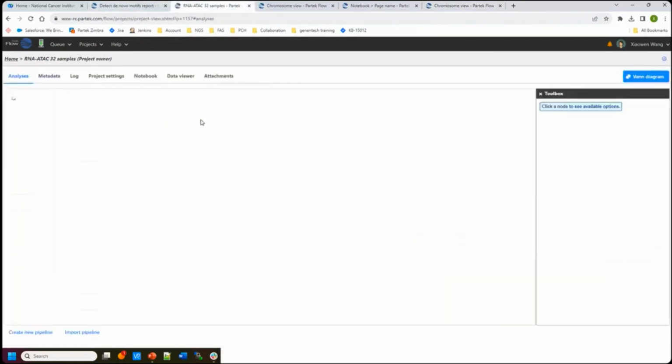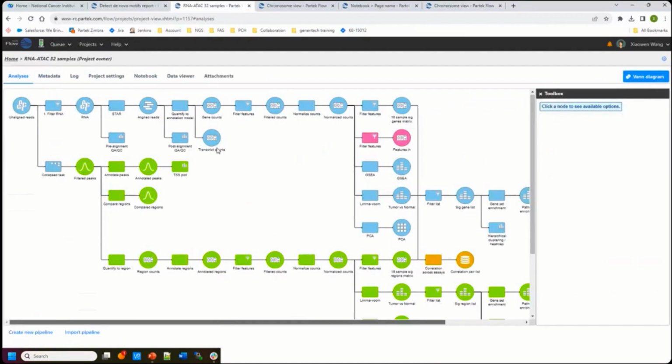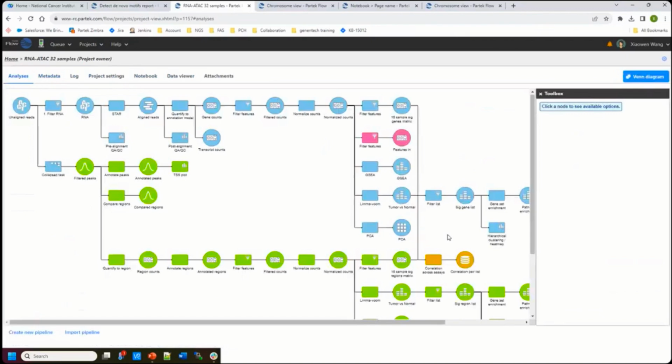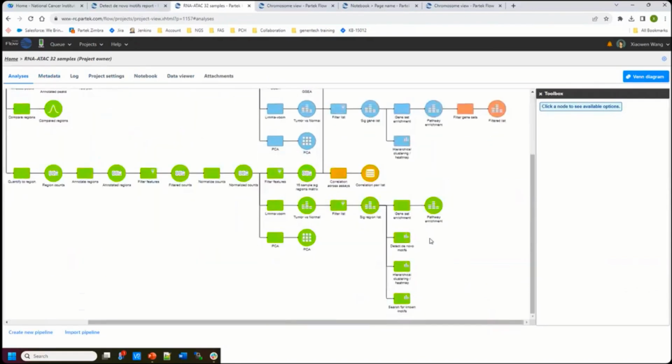To sum up, if you have this type of data, usually it's a very big experiment design. And to perform a correlation, you have to have the same sample, from which you extract the RNA and the DNA, and you perform two different assays. Otherwise, you cannot do the correlation analysis. If they are completely different samples, you can compare with the Venn diagram, do those two branches, and once you have a gene list, use the Venn diagram to compare the genes.